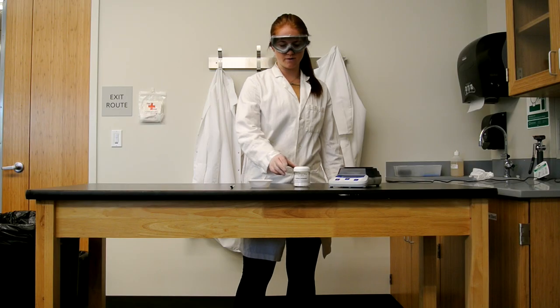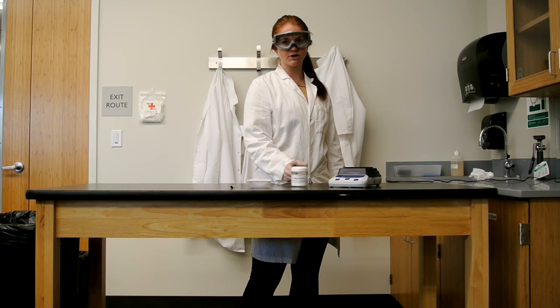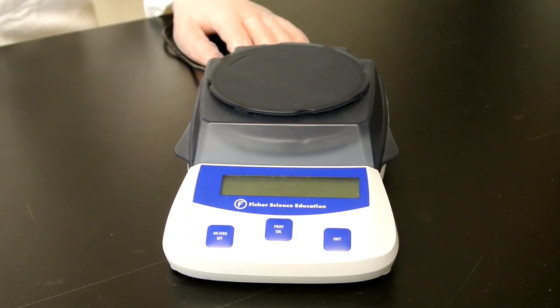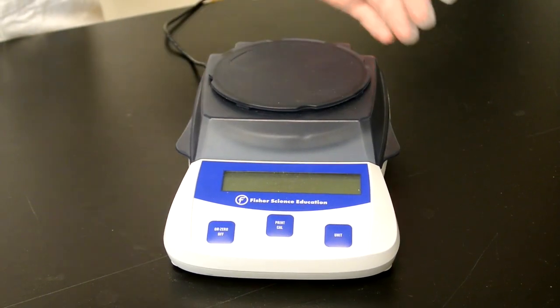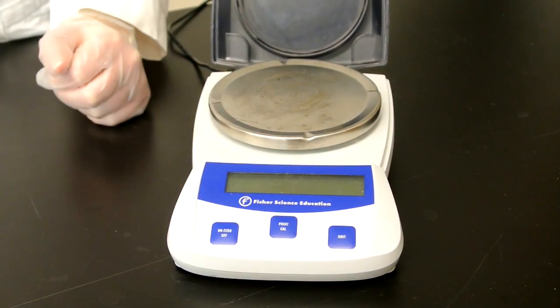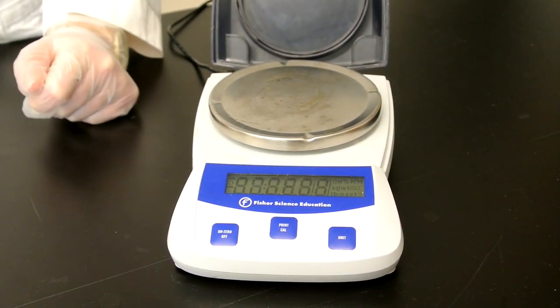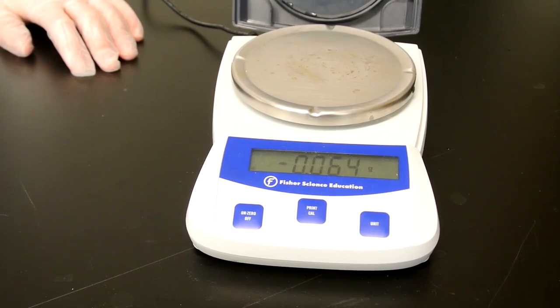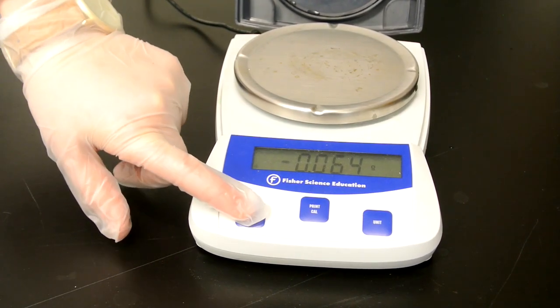Today, I'm going to measure out 3 grams of sodium carbonate. First, plug in the scale. Before we begin measuring the solids, you need to open the lid and turn on the scale. Notice that the scale does not read zero. To correct this, press the zero button.